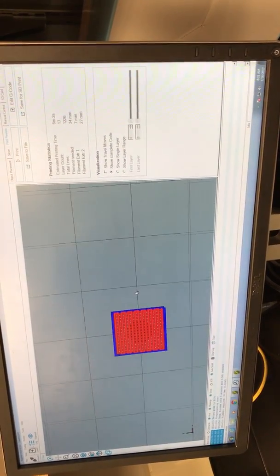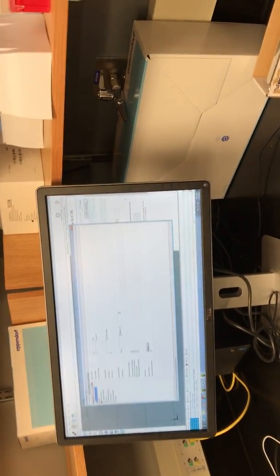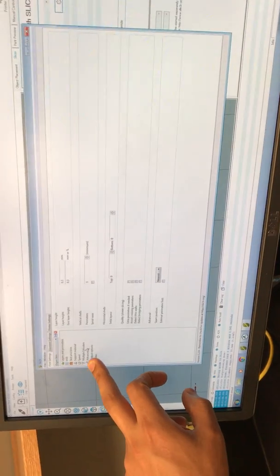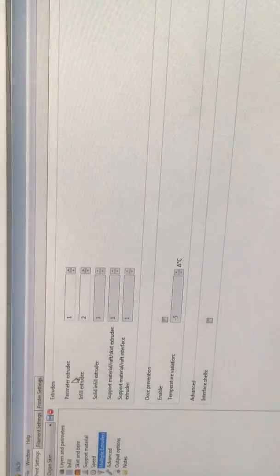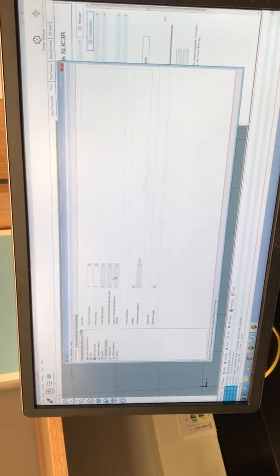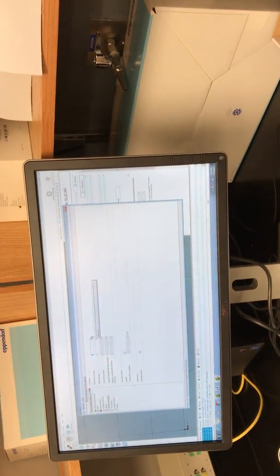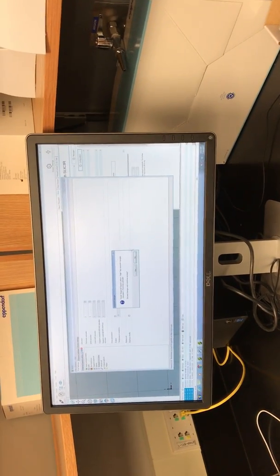And the way you can know is just by going into slicer, configuration, and here, for example, if I go to organ skin, I go to multiple extruders, here it will tell me printhead 1 is perimeter, printhead 2 is infill. If I change the setting to another print setting, everything is printed with printhead 1. And of course you can always just select and change it. So in any of these files you can change.